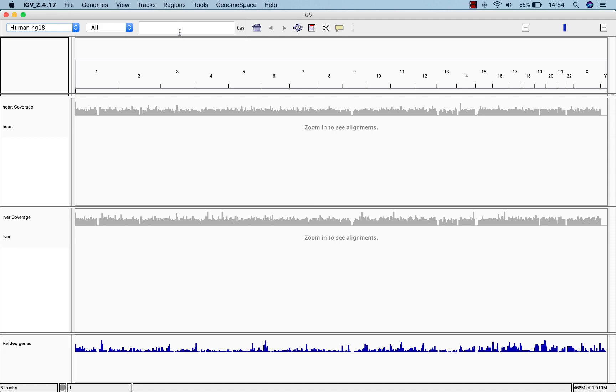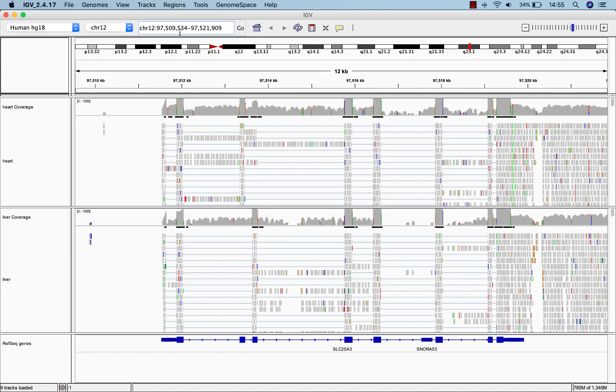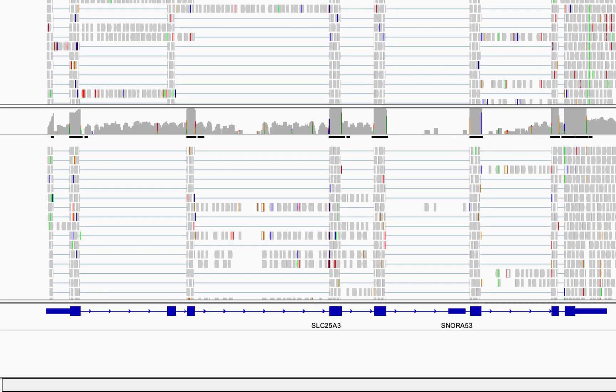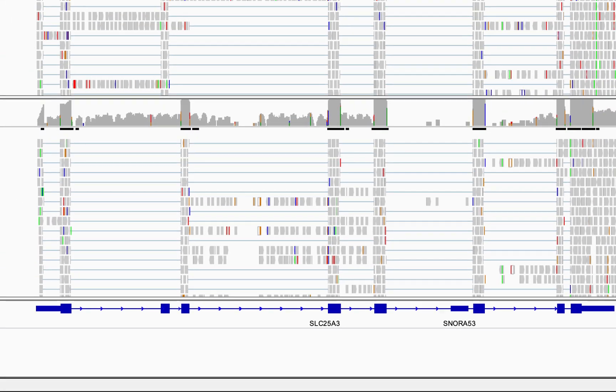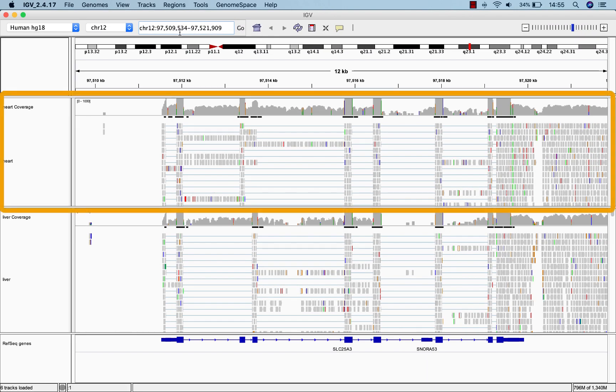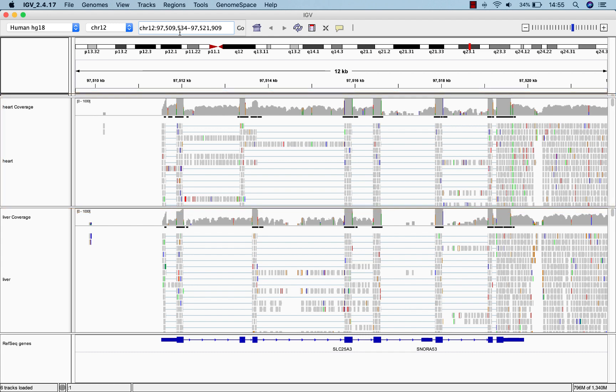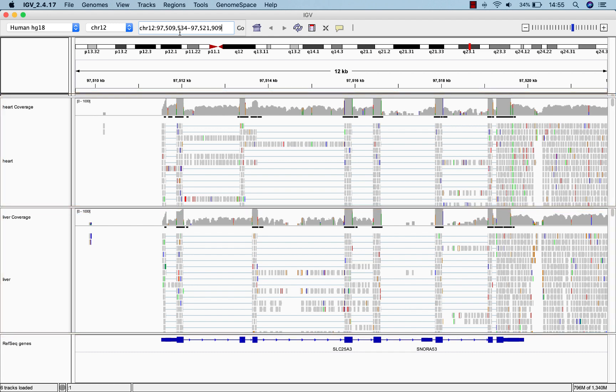Let's zoom in to get a look at the data. Here we're looking at the expression of a phosphate transfer gene in the heart and liver. Because we've loaded two datasets, we have two data tracks, one for heart RNA-seq data and one for liver RNA-seq data. Each dataset gets its own coverage track and alignment track.